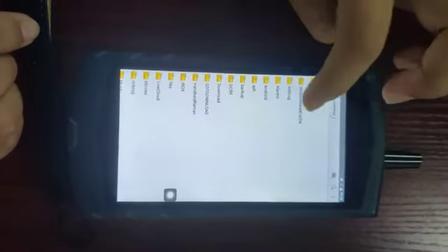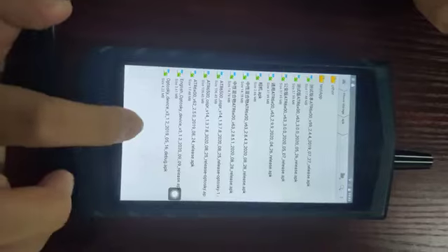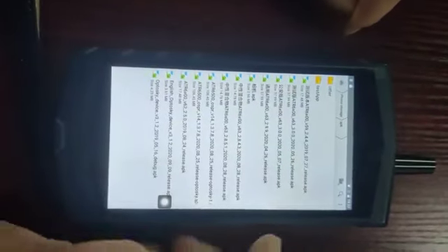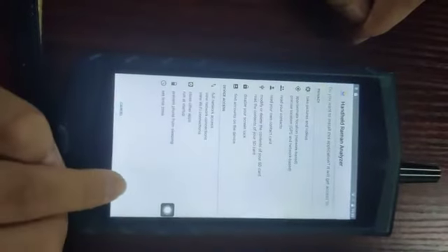Now click File Manager. Copy the latest library app here. That is the English app. That is this file. Click it and install the latest library app. Now, done. You have finished the installation. Secondly, you need to install the test handheld Raman analyzer.